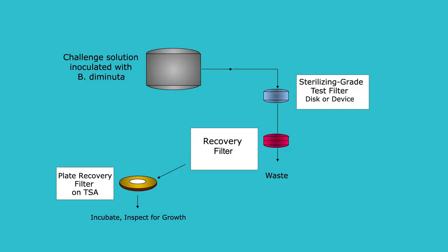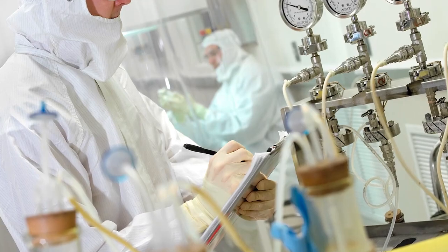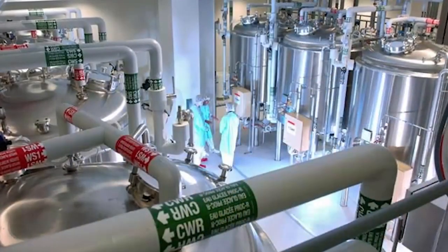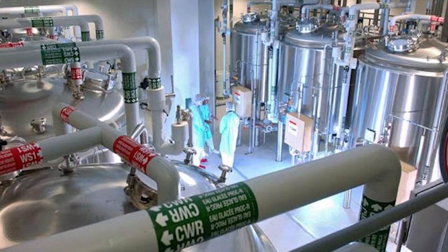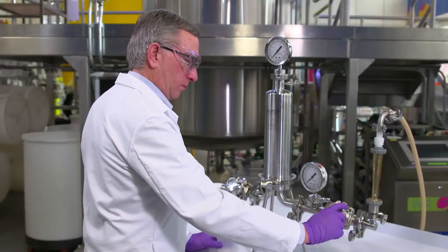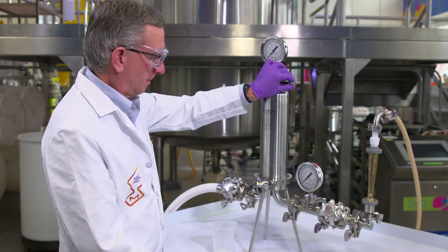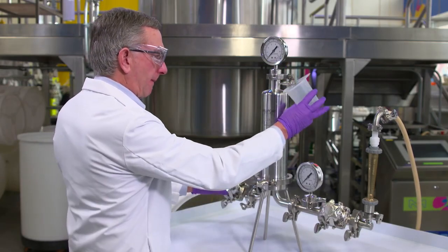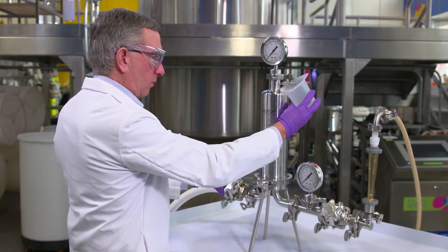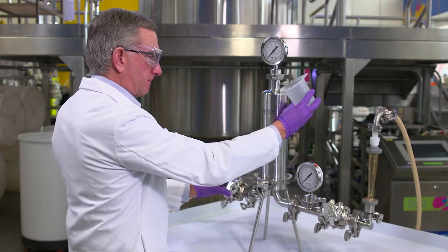The retention test is a fantastic way to see if a filter is sterilizing grade because it's the real deal, it's extreme worst case, and it's very sensitive. Filter manufacturers routinely use the test during membrane development and as a membrane and device QC test. The only problem with the test is the filter gets contaminated with bacteria, which makes it completely unsuitable for an end user's process. What we need for routine testing in a biopharm manufacturing environment is a test that correlates to the bacterial retention test but does not contaminate or alter the membrane in any way. Remember, retention is based on pore size. That's what we want to know. Fortunately, capillary forces are also dependent on pore size, and this gives us a couple options for non-destructive integrity testing.